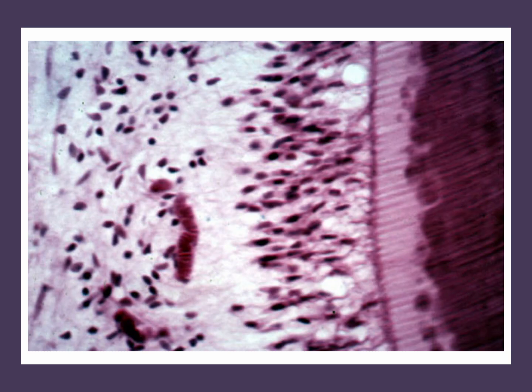If we go underneath, of course, we can see the supra-odontoblastic layer here too. Underneath it, we can see the odontoblastic layer, as you can see here. And underneath it, remember the theoretical lecture, there is a cell-free zone, and we said it is better to call it the anuclear zone, because actually there are cell processes of fibroblasts, odontoblasts, capillaries, and nerve terminals here. So it's not cell free, it's nuclei free, an anuclear zone.